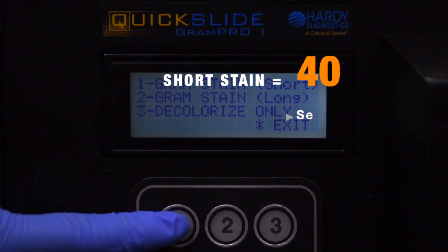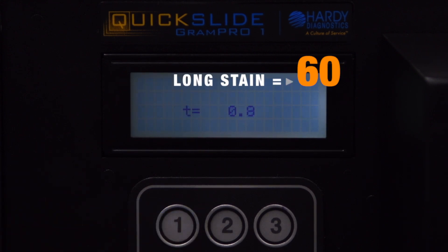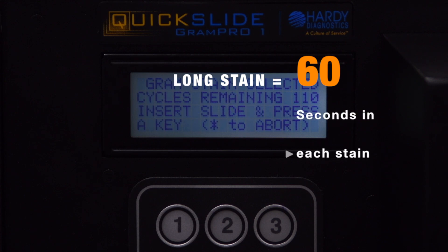The short stain soaks the slide in reagents for 40 seconds. The long stain soaks the slide in reagents for 60 seconds.